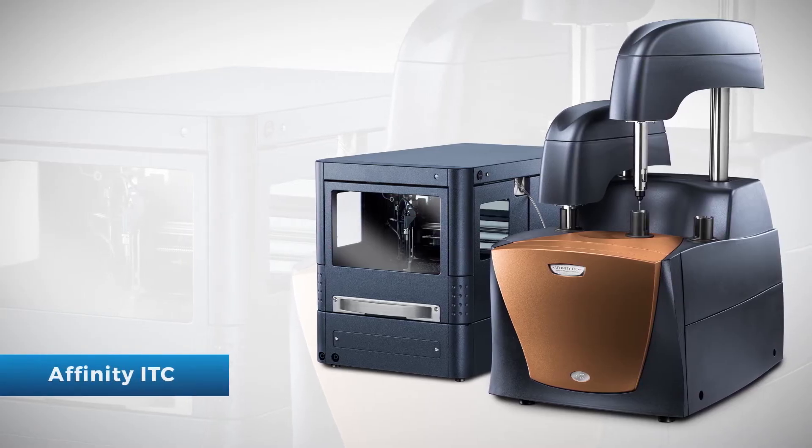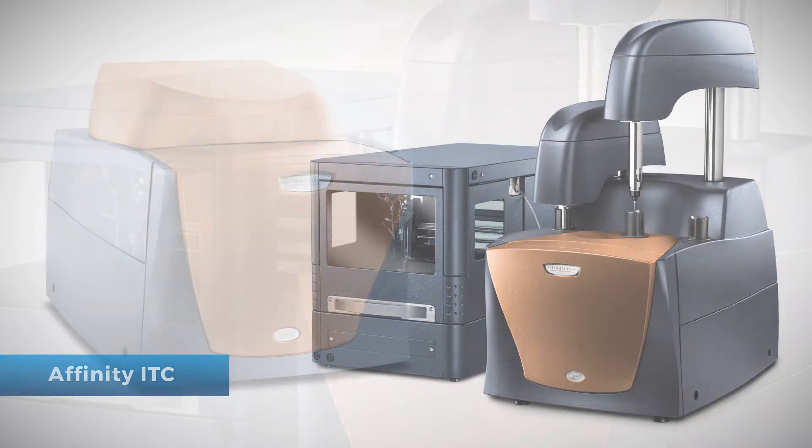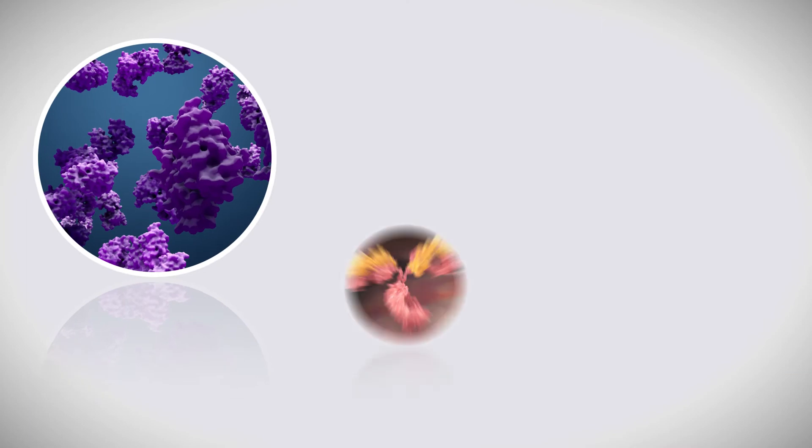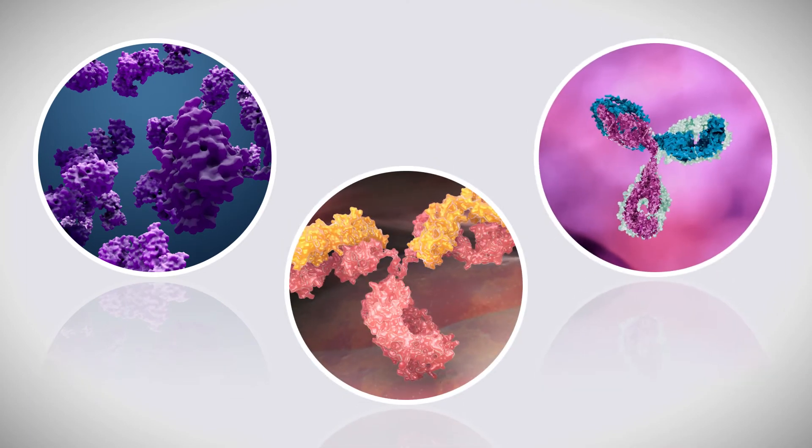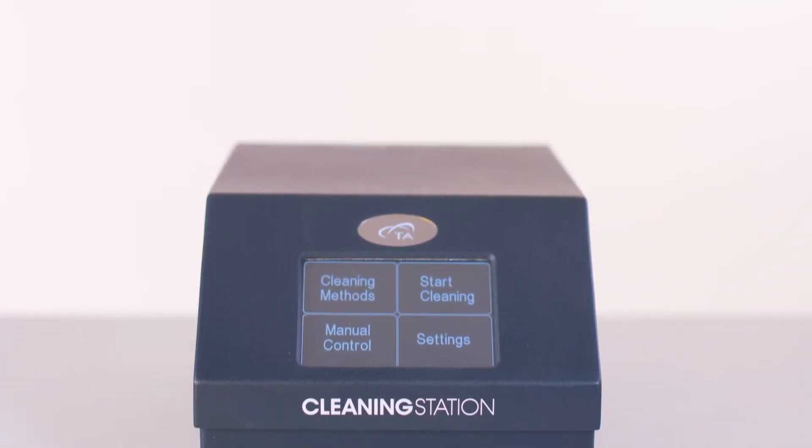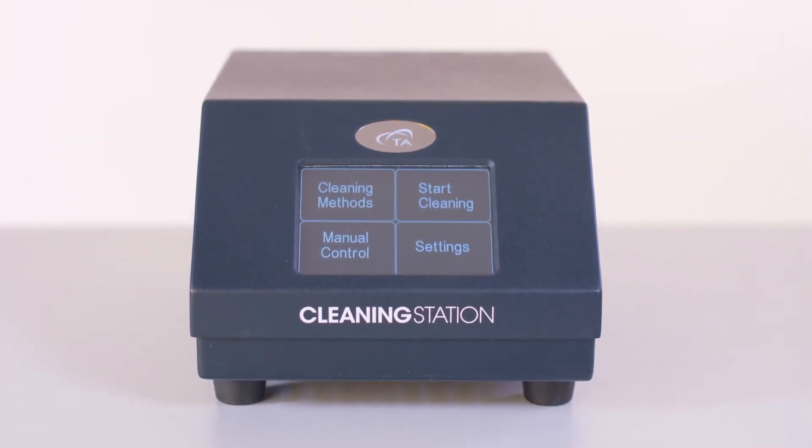The TA Instruments isothermal titration calorimeters and nano differential scanning calorimeters are commonly used to study proteins. Sometimes these proteins require the use of large volumes of water to properly clean the cells. In this Tech Tip, we will be using the automated cleaning station in manual mode with water to rinse the sample cells.